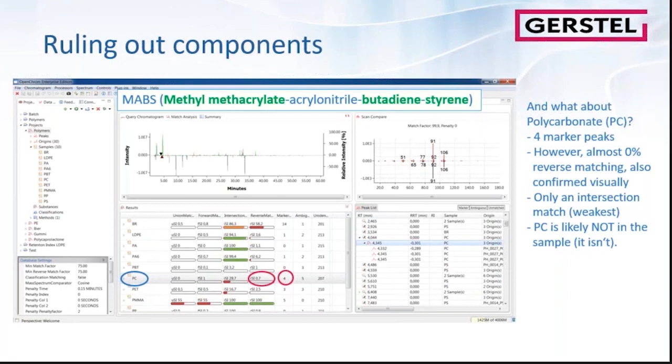I have to say we have chosen only a very short list of entries. The longer the list, the lower the marker numbers get, and the more accurate the matching results would be. So we have shortened the list of entries just to get false markers, not false markers is wrong, perhaps not that specific markers, just to show how to rule out components.